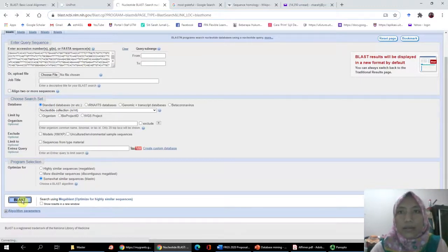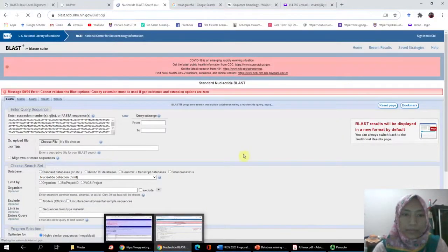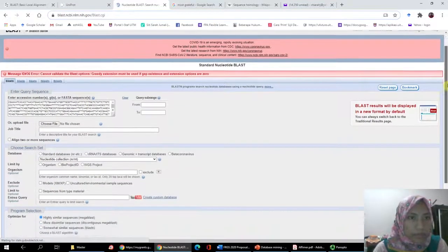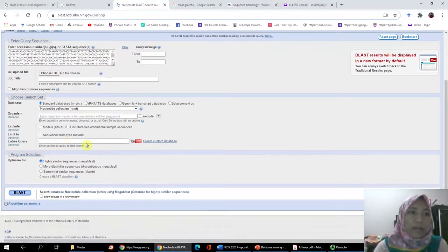Okay, it takes a while. In the meantime, sorry. Okay, there is some error.